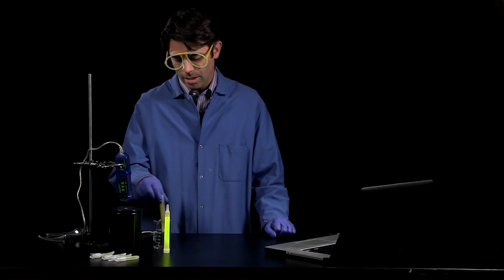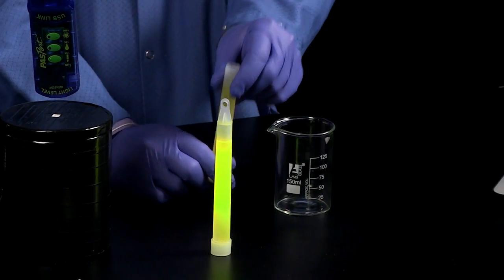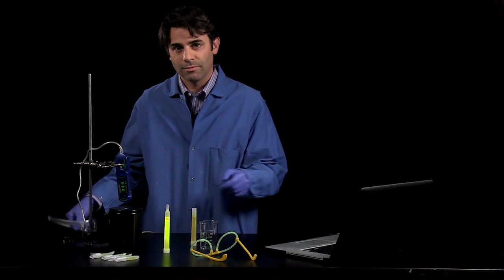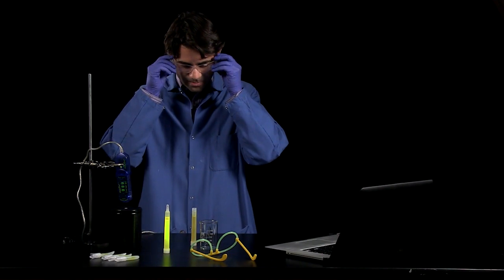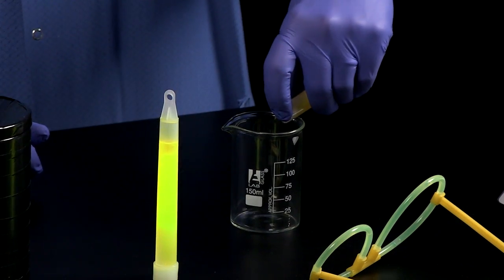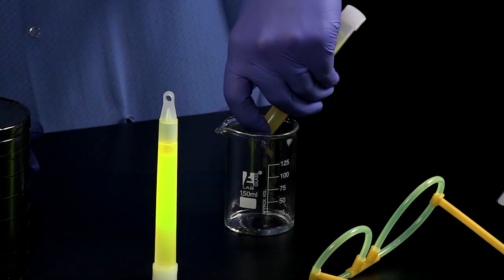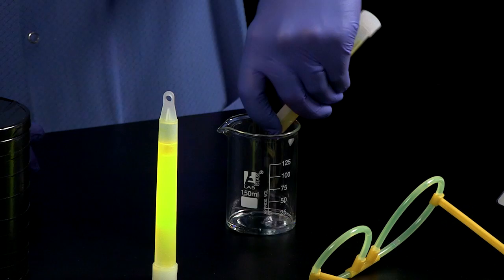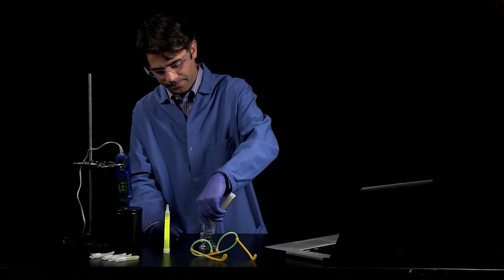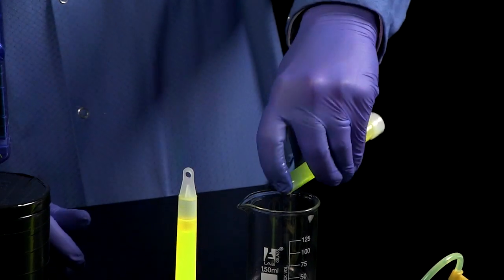Now, to do this, I want to separate the reactants. So I took a glow stick, and I cut the top off, and I'm going to pour one of the reactants into the beaker, and then I'm going to break the vial and pour the other reactant in.